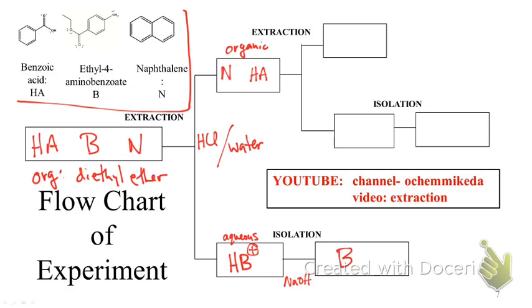Adding solid sodium hydroxide to anything is going to be a bit of a pain, particularly because you'd have to deal with the very concentrated sodium hydroxide tablets, which could easily burn you. So we typically come up with a better way to add it to a reaction. What do we do? We dissolve it in a secondary solution like water. So we end up adding aqueous sodium hydroxide. The sodium hydroxide reacts with our now acidic base, removes the hydrogen, and we're left with B.